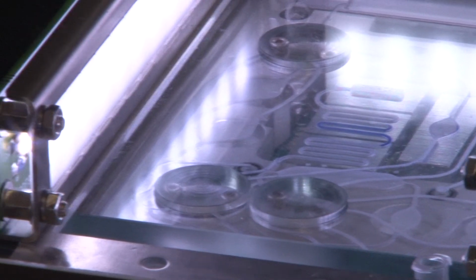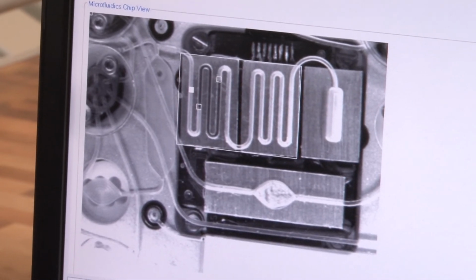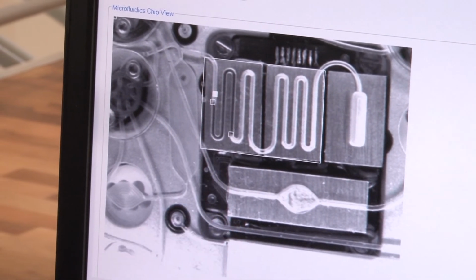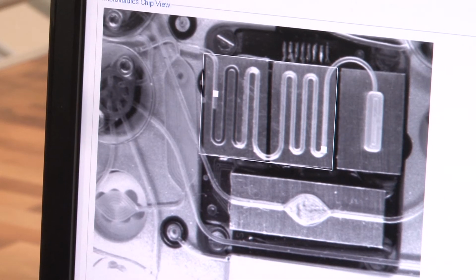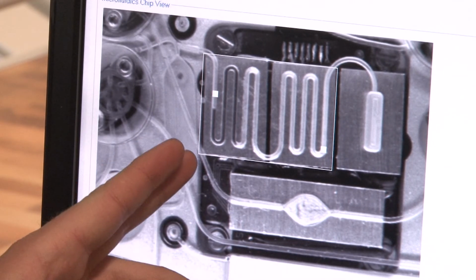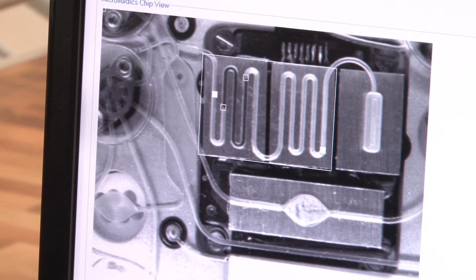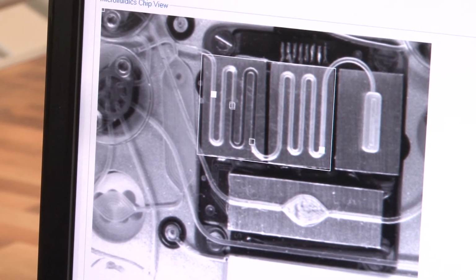This is the range. The actual temperature is very accurate. In this particular example, we have 60 and 90. So as you see, the sample goes back and forth in order to achieve polymerase chain reaction and amplify the DNA. When it is in the cold zone, the sample waits for 20 seconds before it moves to the hot zone again, as you can see it doing now.